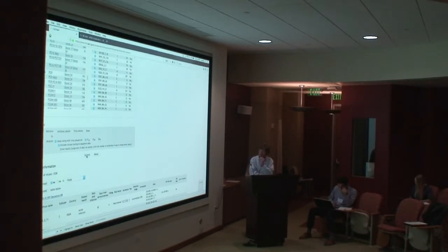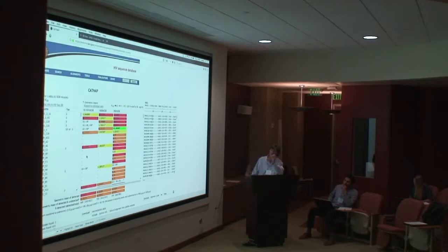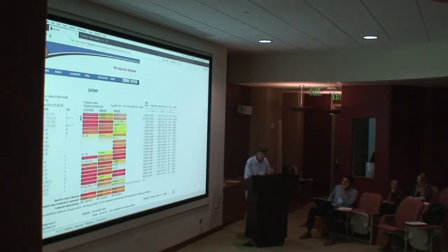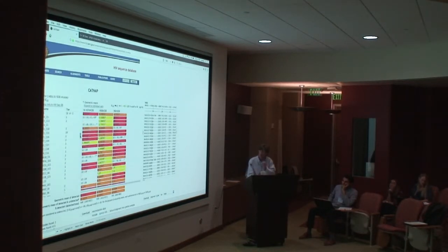And now this is sort of where the rubber hits the road for this tool, because what we have here is first a list of different viruses and their sequences, and a list of these three antibodies that we asked for, and here are the neutralization values for each of those antibodies against that virus. I asked for all the viruses in here. There are 1,000 of them, and we can scroll through.